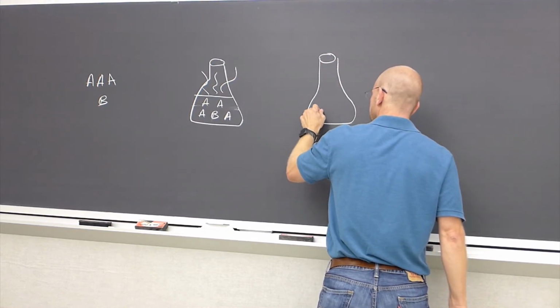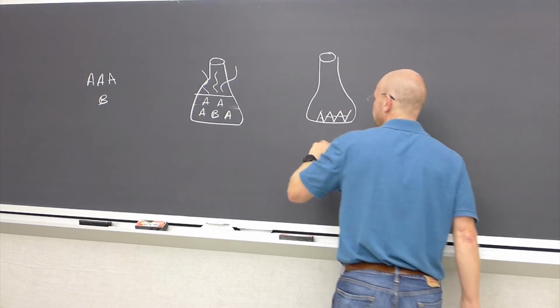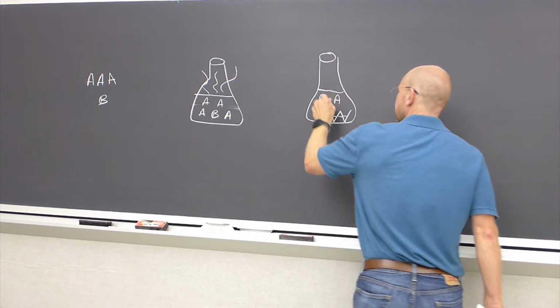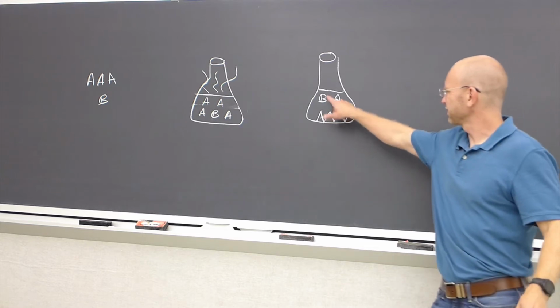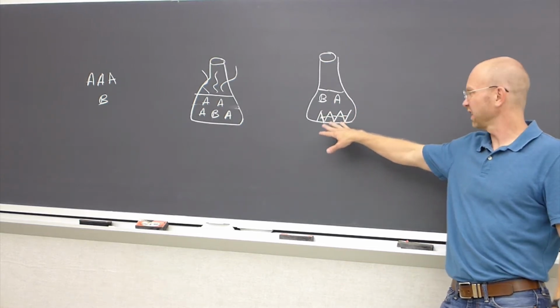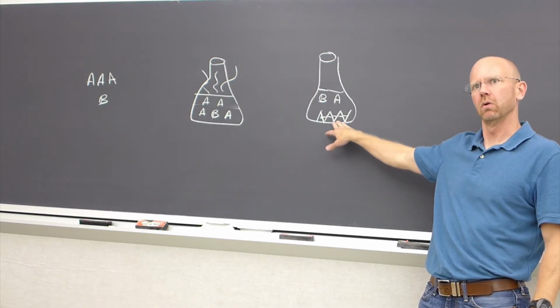is you're going to start to form crystals of that A molecule first, and the hope is that you get a more dilute solution of A and B above the top, and these are still in solution, and A is all clumped at the bottom, right? And let's say this is the situation when it gets down to room temperature after you let it slowly cool.